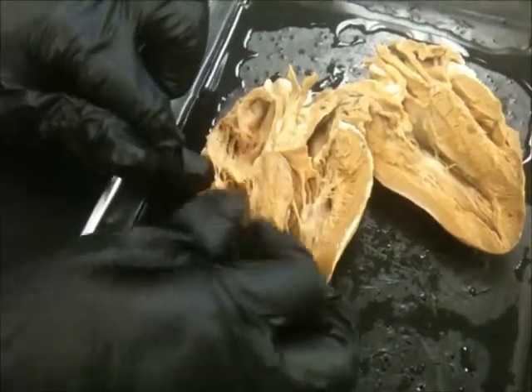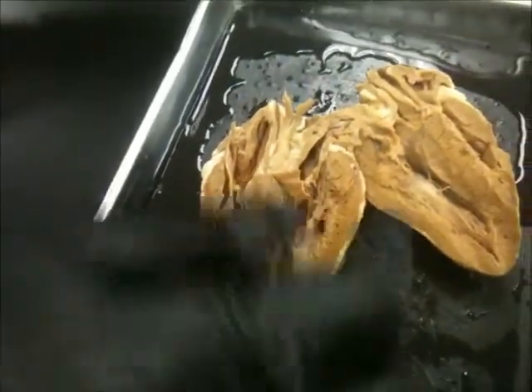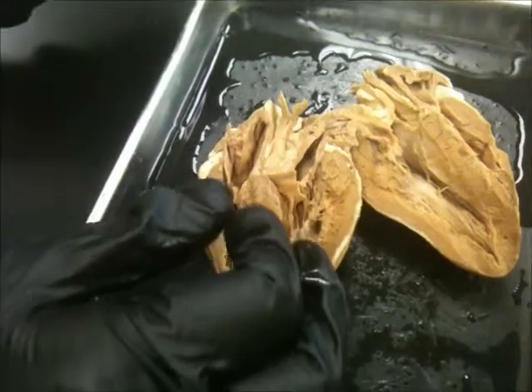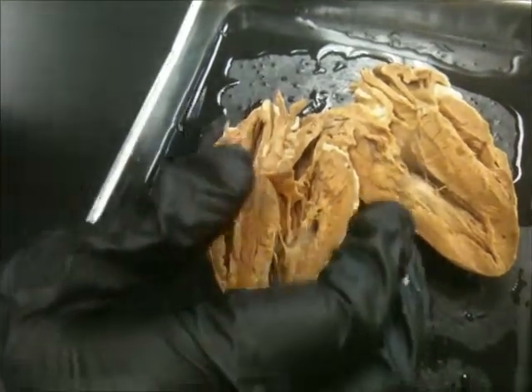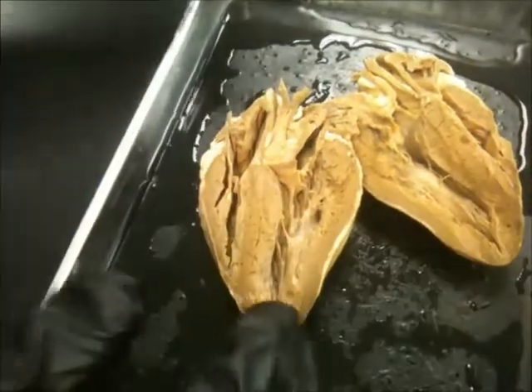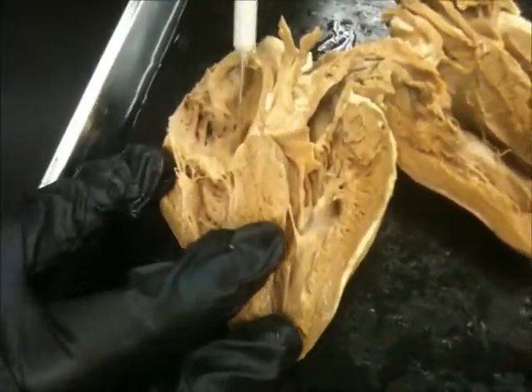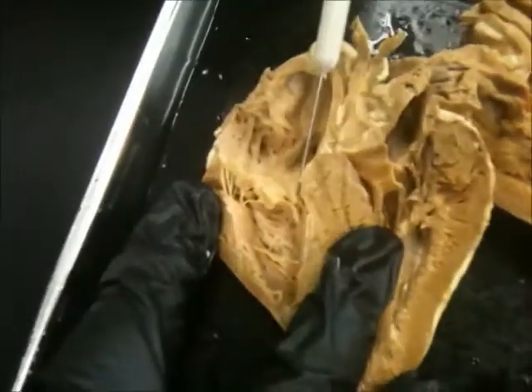And do you see the chordae tendineae? In the red bag there is a... that black thing, pull it out. That's the wine cork. So these are the chordae tendineae, right?